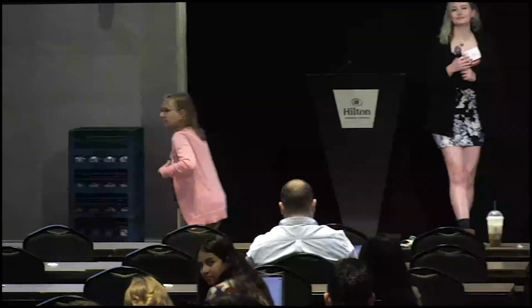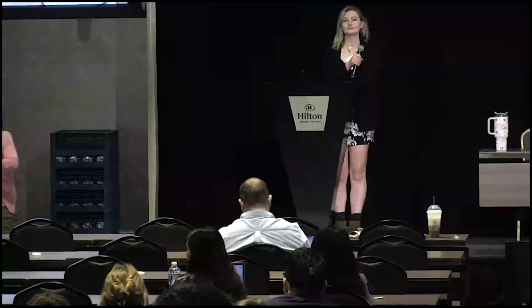Hi, this is Daniel, assistant professor at the University of Maryland. So I think one thing that you might have overlooked in the presentation, which might seem obvious, is that when you use Golden Gate cloning, it actually matters that whatever level 0 you put in doesn't have those same restriction sites, because you have to domesticate it, right? So that's one of the disadvantages of all of the MoClo systems.